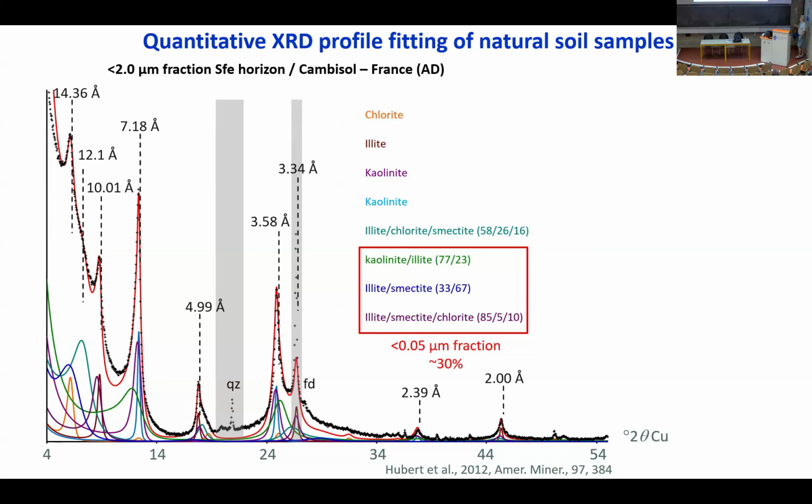Why? The question you may ask now is whether, with that many contributions, it's possible to fit an elephant. Yeah, but if you remember correctly, what I showed you in the very beginning for this specific sample is that we had 2 diffraction patterns: one after calcium and air dry condition, one with calcium and ethylene glycol solvation, meaning that we have a blue elephant and a pink elephant. And we should be able to fit them equally with the exact same model here.